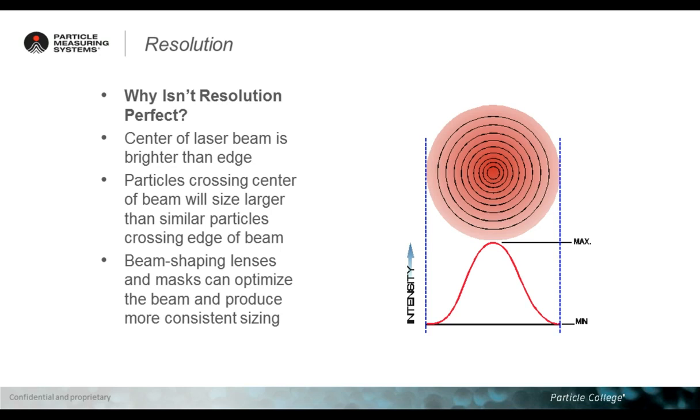In the middle of the circle, the red color is darker and stronger, while on the edge it becomes a little clearer. If particles fly right in front of the center of the laser beam, this results in a higher peak. If they fly in front of an edge, this may result in a smaller peak generated by the photodetector.